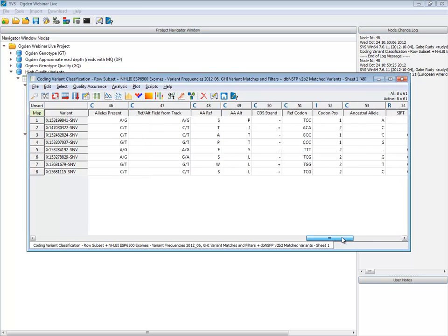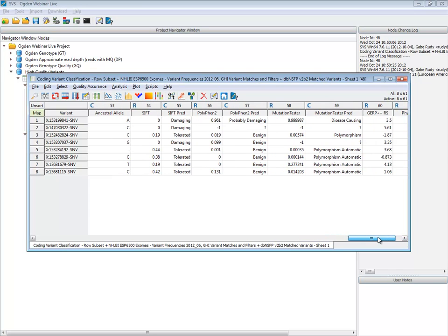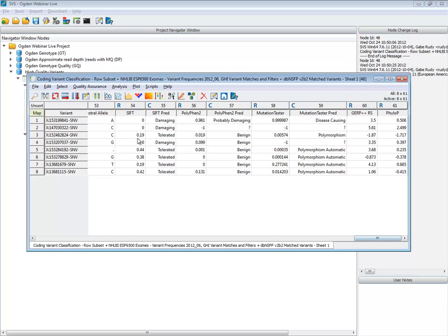And again, we have a number of functional prediction tools all kind of brought together: SIFT, PolyPhen, MutationTaster, and some conservation scores. Remember, our first row here, the top of the list, is the rare or the completely novel variant. It's predicted as damaging, probably damaging, and disease causing. So essentially a full suite of predictions saying that this is likely to be a variant that knocks out the gene function. It's also highly conserved by the two different conservation scores.